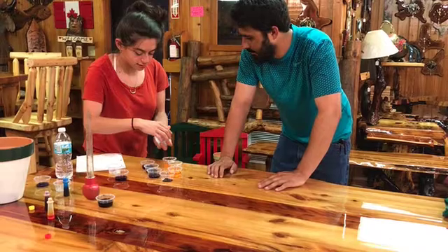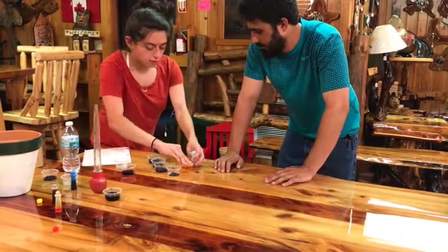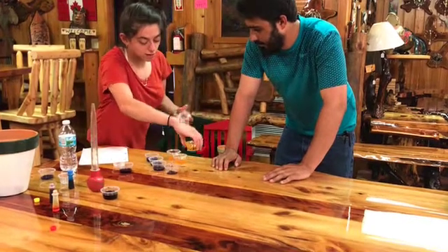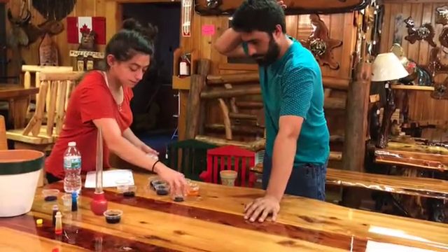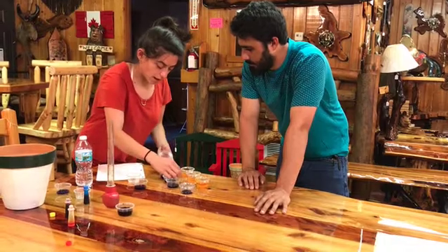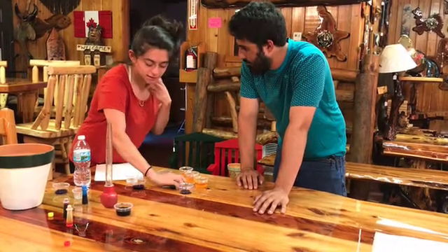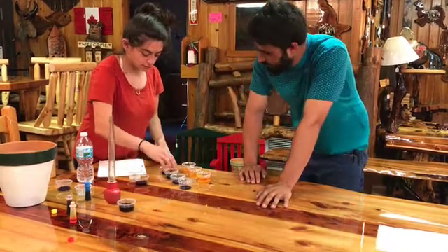Invert it. Or you can also vortex, but we are very underfunded and we don't have a vortex. So we just invert them to make sure it's all nice and mixed. Parafilm is very useful, as you can see. Okay.